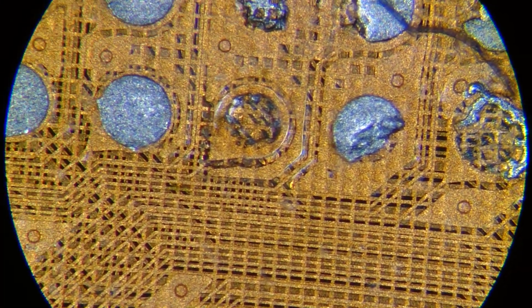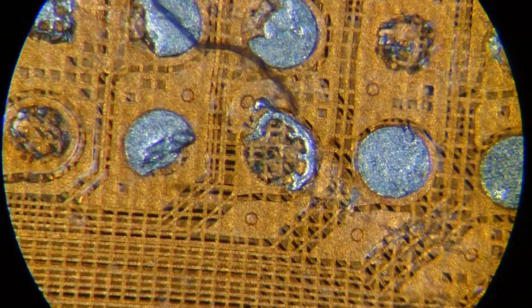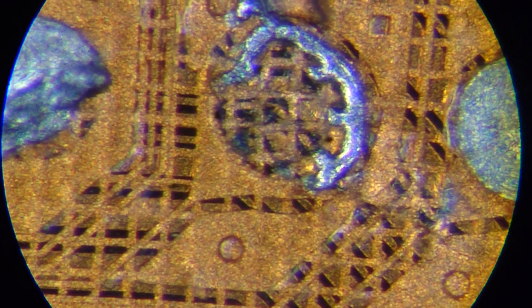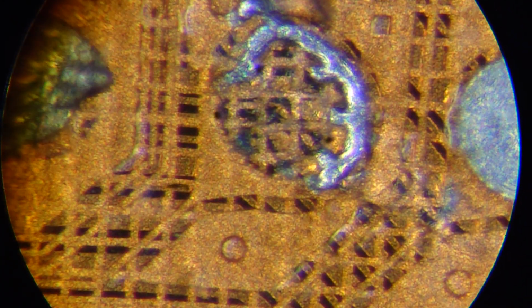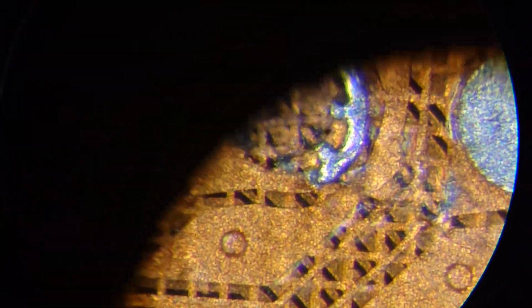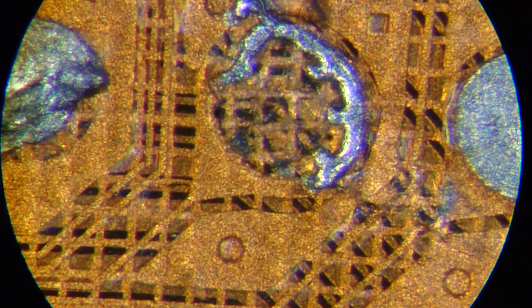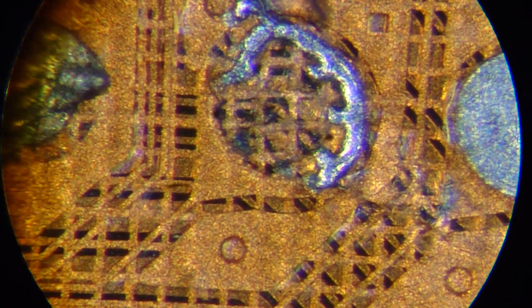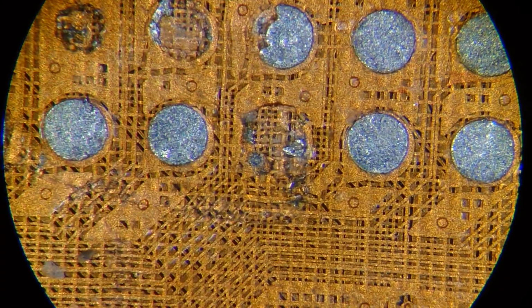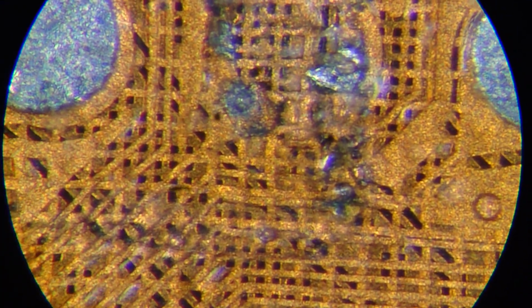When this objective is set on a SMZU, by Maxim for instance, its real resolution is 12% lower than in this case. 12% is obviously a substantial amount, but not that much, to be frank. But still, this objective on an SZX12 gives us much more details than when it's set on the SMZU. Okay, so just a few parts left to look.